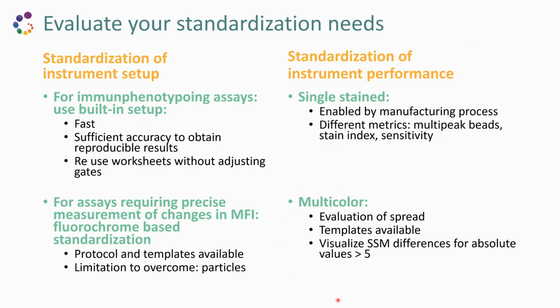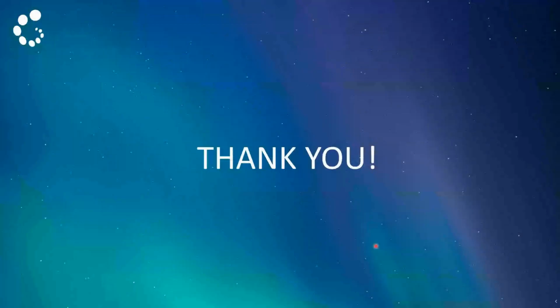or contact us if you want to learn more about it. And when you are in the multicolor scenario, you know that spread is the main variable that we need to take into account. It's a key variable when it comes to panel design, and is a variable that we need to assess when comparing instrument performance. We have a lot of tools available to you to do these comparisons, and we have guidelines on how to interpret the data.